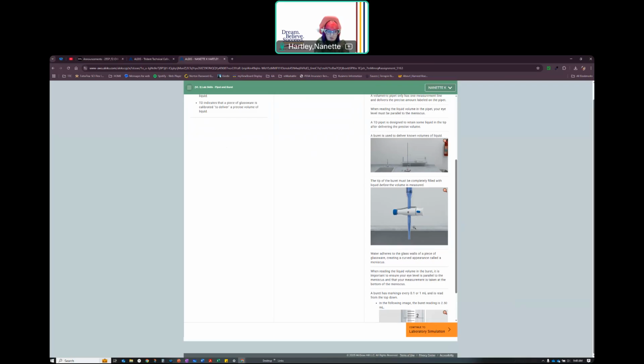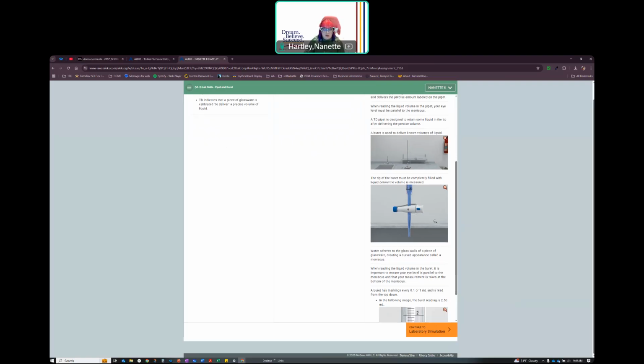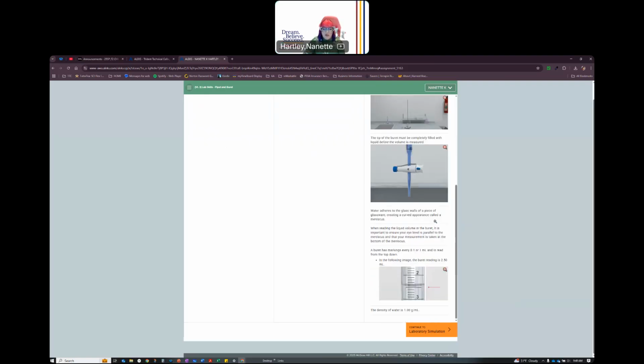But they can also be very problematic if they're very thin, because they're very easy to break. So there is a risk and reward with that. So we have problems with working things that way. We have to be cautious with working with that kind of glassware.